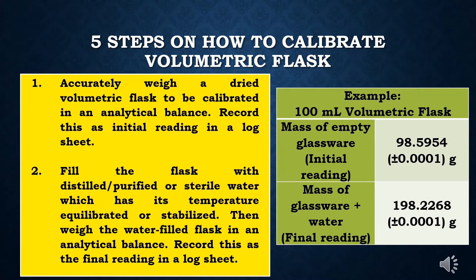For the volumetric flask, the steps are as follows. Step 1: accurately weigh a dried volumetric flask to be calibrated in an analytical balance; record this as the initial reading in a log sheet. Step 2: fill the flask with distilled, purified, or sterile water which has its temperature equilibrated or stabilized.